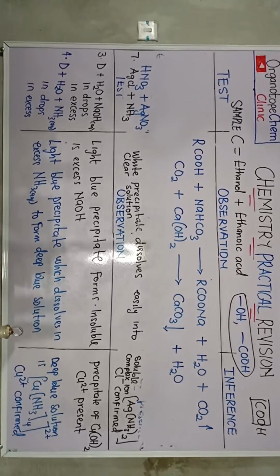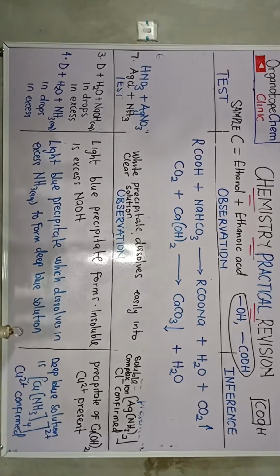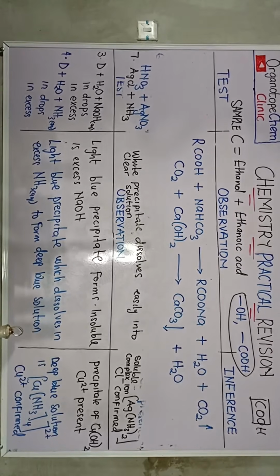Can we proceed? Yes, reaction for test 2. The test 2 is esterification reaction.